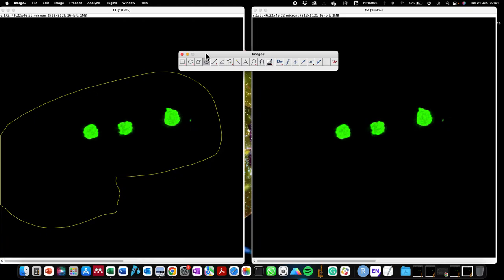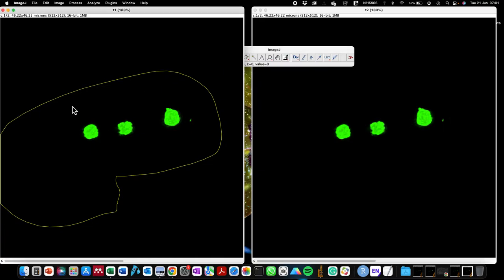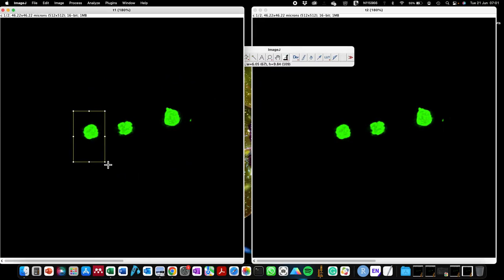I'm going to show you how to draw your region of interest and duplicate that specific region of interest to get several copies on your single image. To get your duplicated region of interest, click on the type of selection tool you are interested in. For instance, if we are using the square one, we just draw a square region of interest on one of the regions we are interested in.